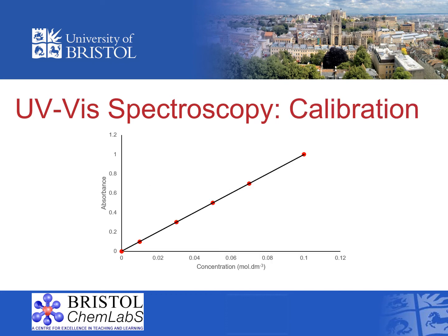By using this UV-Vis technique alongside the Beer-Lambert law, you can work out the concentration of a UV-Vis light absorbing molecule through the creation of a calibration curve. If a known concentration of sample is measured, this creates a known data point on a concentration absorbance graph. By plotting at least 3, but generally more, different known concentrations, a calibration curve can be generated.